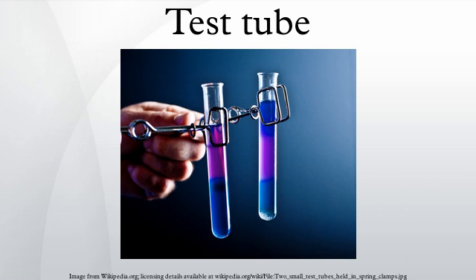Where large numbers of tests are run or only small amounts are available for testing, or both, microtiter plates are often used as small test tubes. Manufacture: test tubes for physics and chemistry are usually made of glass for better resistance to heat and corrosive chemicals and longer life. Tubes made from expansion-resistant glasses, such as borosilicate glass, can be placed directly over a Bunsen burner flame. Culture tubes for biology are usually made of clear plastic by injection molding and are often discarded after use.